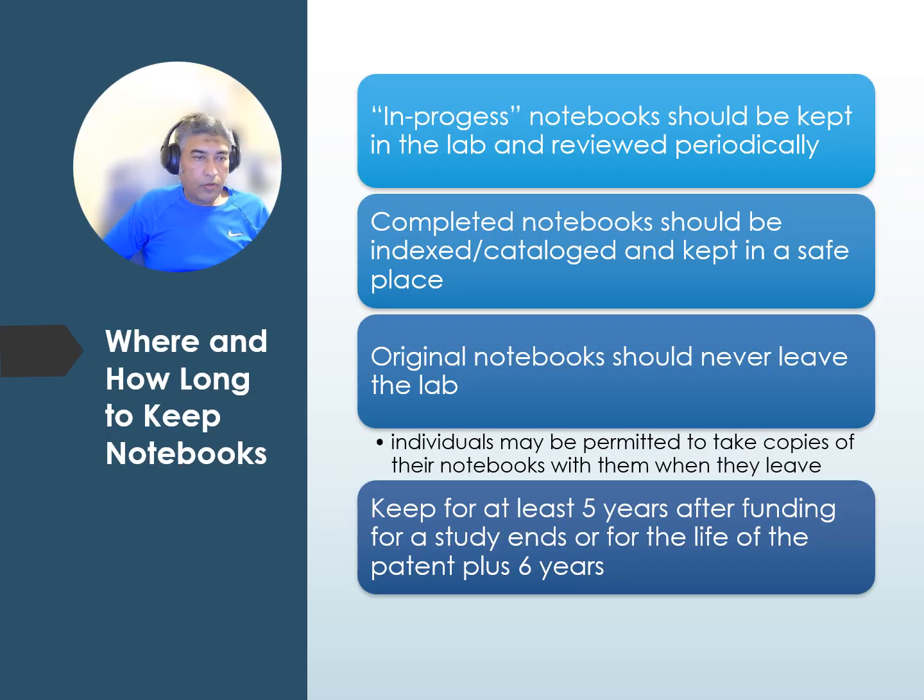Where and how long to keep a notebook? A notebook in progress should be kept in the lab and reviewed periodically. A completed notebook should be indexed, catalogued, and kept in a safe place. The original notebook should never leave the lab. Individuals may be permitted to take copies of their notebook with them when they leave. Keep it for at least 5 years after funding for a study ends, or for the life of the patent plus 6 years.